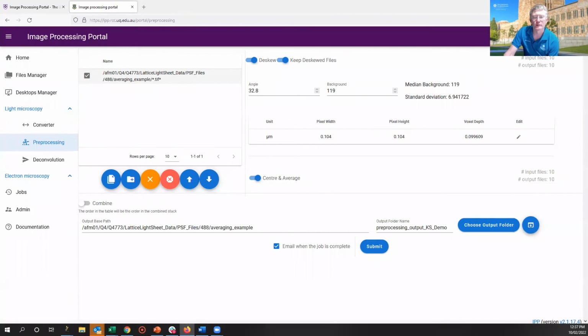Yeah. We do have another project with UQRCC called Phoebe that does non-sequential parallelized live processing of the data sets too. So we can convert on the fly from the slide book format to TIFF and then visualize them, but that's not part of this portal currently.